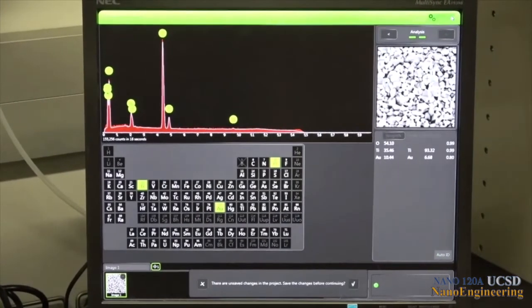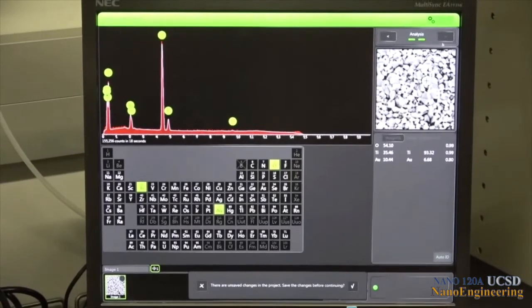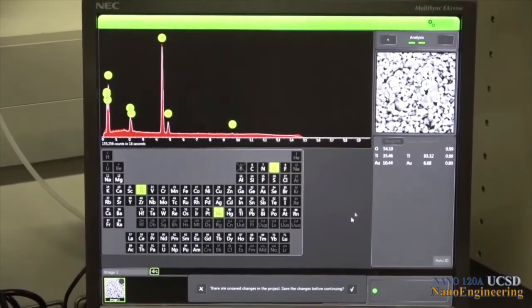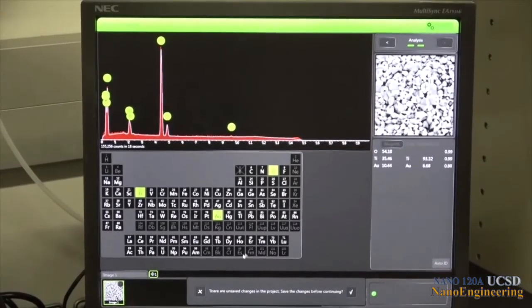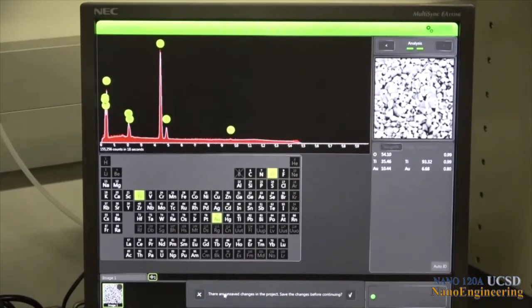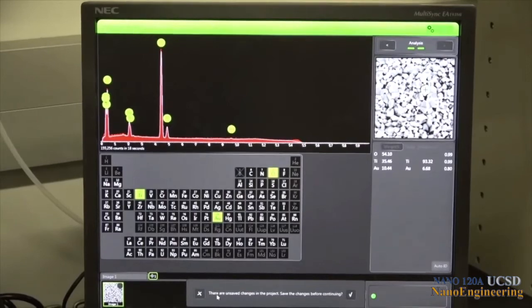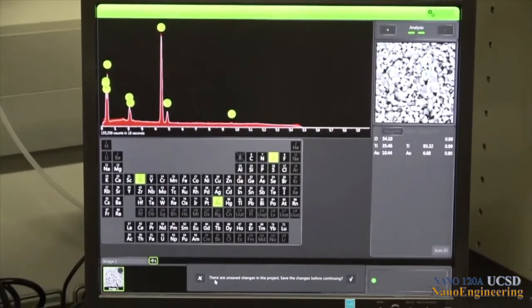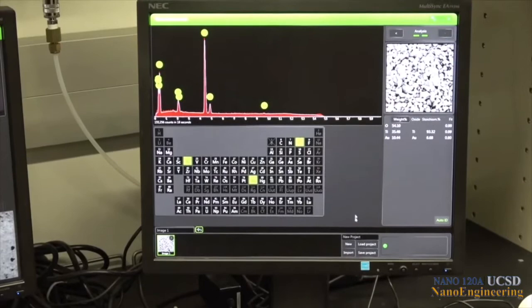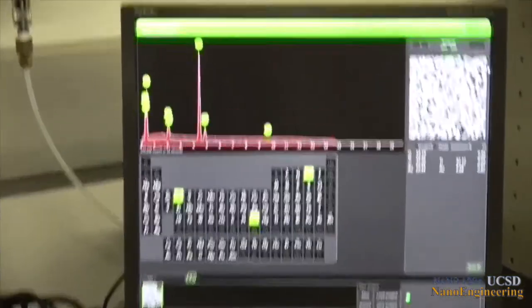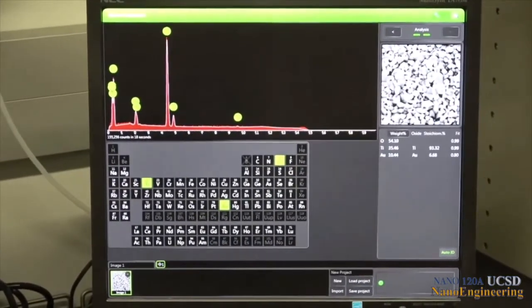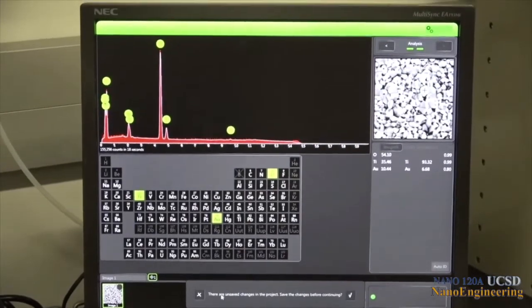Obtaining accurate quantitative analysis depends on careful setup of the instrument so as to get adequate X-ray counts. This may mean counting for longer times than the standard time or even adjusting the height of the sample in the holder to position it for better X-ray collection. When performing X-ray analysis this tool provides some information on setup issues such as if a lower accelerating voltage is being used to do X-ray analysis or if the sample height is not optimum for X-ray collection so that the user can make corrections. These warnings will appear at the bottom right of the screen with a red flag.